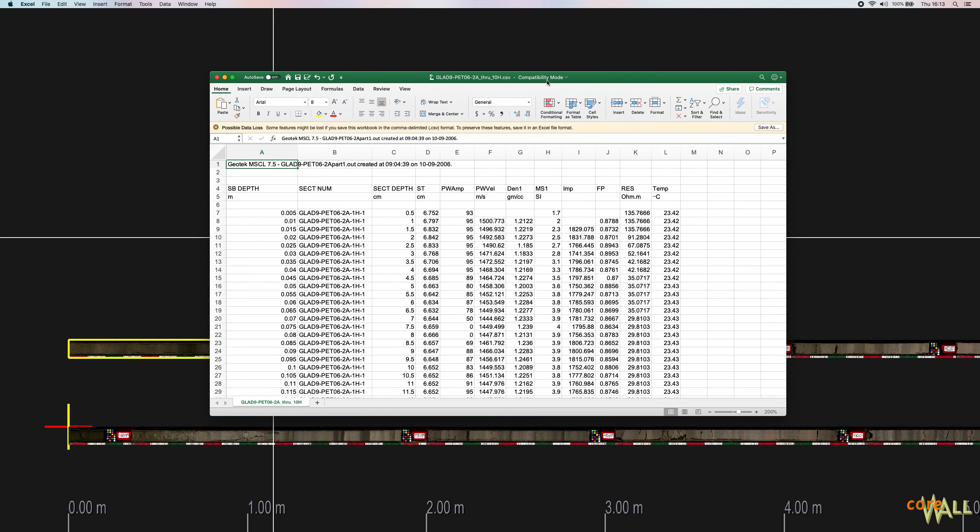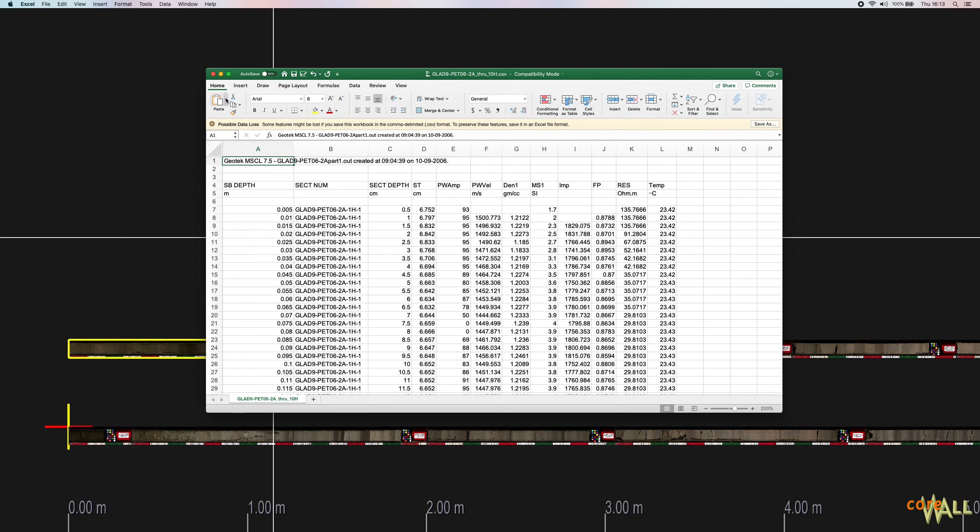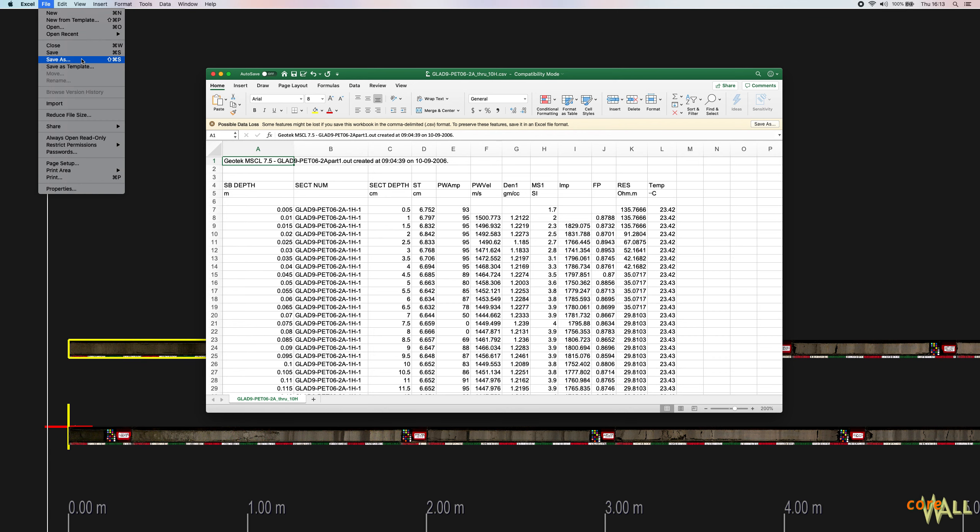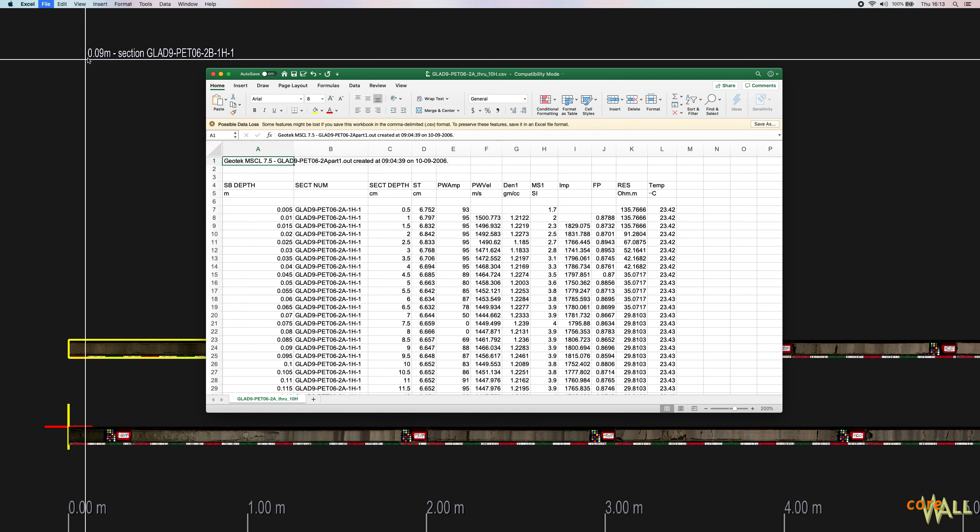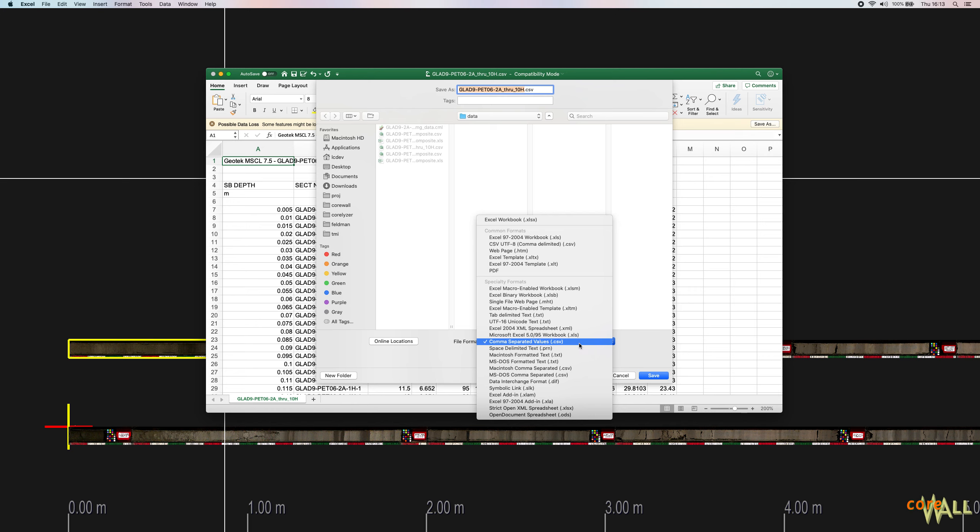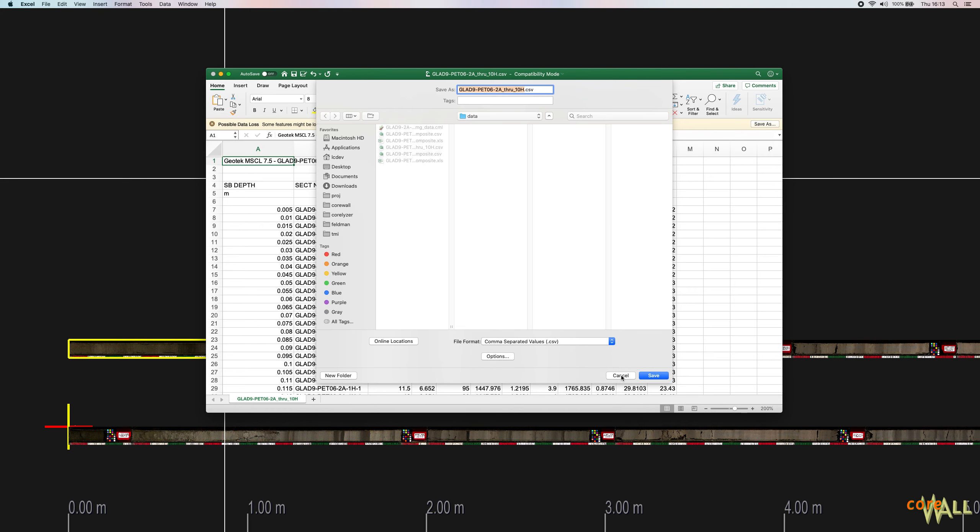If your data is in the Excel format, you can save it as CSV by going to the File menu, choosing Save As, and then choosing the comma separated values format and save.